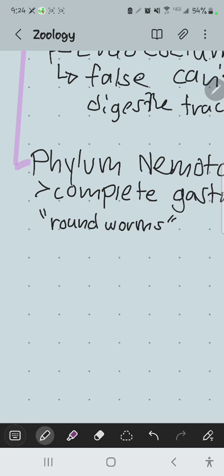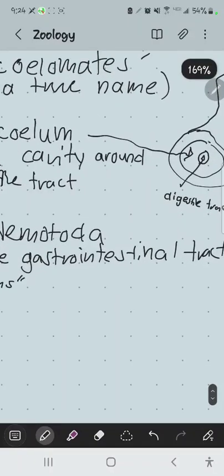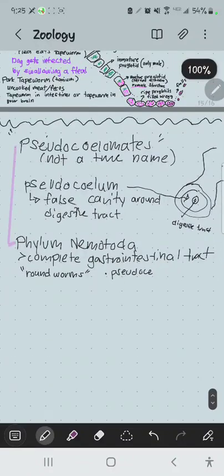There's a complete gastrointestinal tract. We have a pseudocoelom. The other feature that the nematodes have, which is unique to them and to the arthropods, is a cuticle on the outside. So I'll identify each of these things in the drawings as we go. But how do you describe the nematode? It's basically like a tube on the outside, and there's a tube on the inside, which is the gut tract. And that's sort of the best way to describe the nematode body plan.